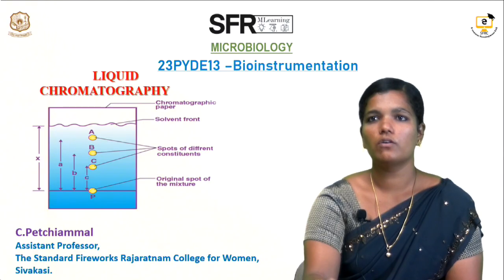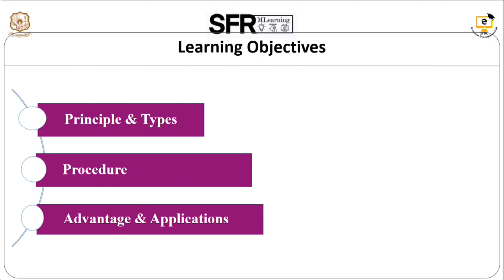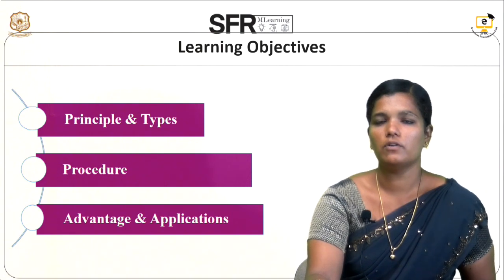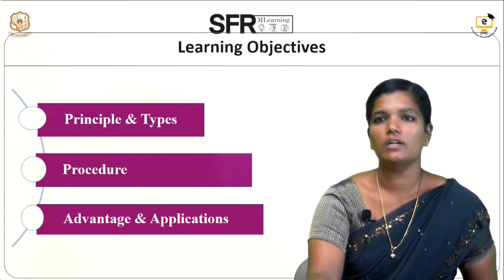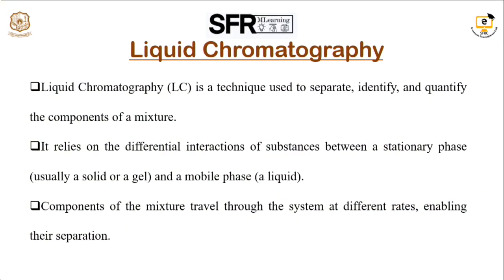Today we are going to see the topic liquid chromatography. Learning objectives: this includes the principle and types of liquid chromatography, the procedure of liquid chromatography, and the advantages and applications of liquid chromatography. So what is liquid chromatography?